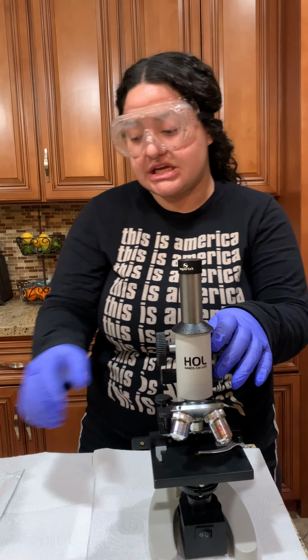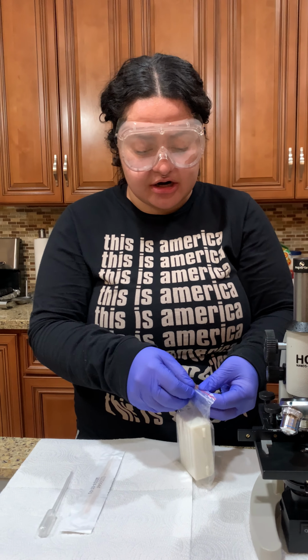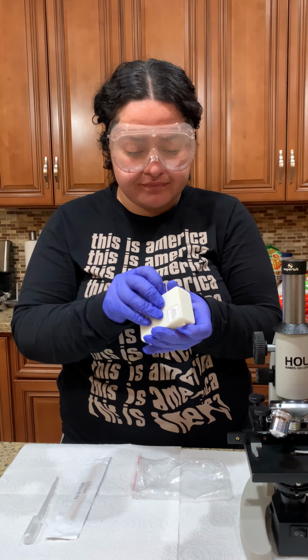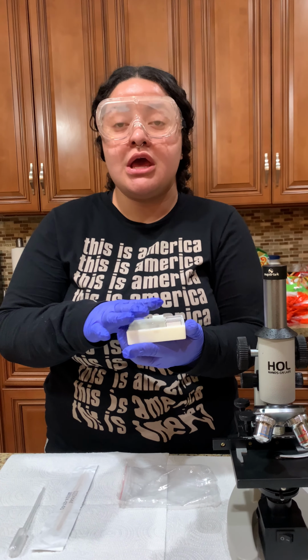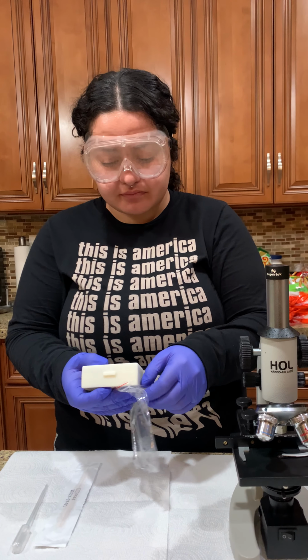One of the exercises is to use the slides that are in the lab kit and put them under the microscope and observe them at their best magnification. And then just go ahead and see. So we can see we have different slides. We have 6 different specimen slides, and then one of the letter E. All my observations will be on my lab report.